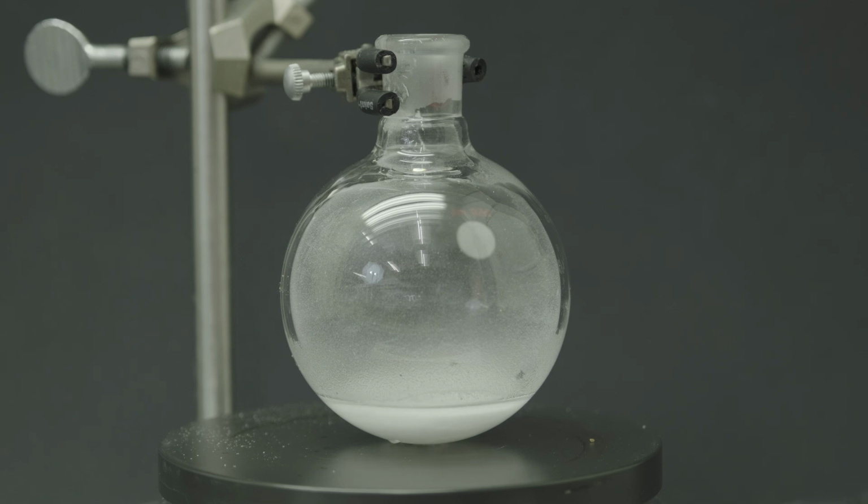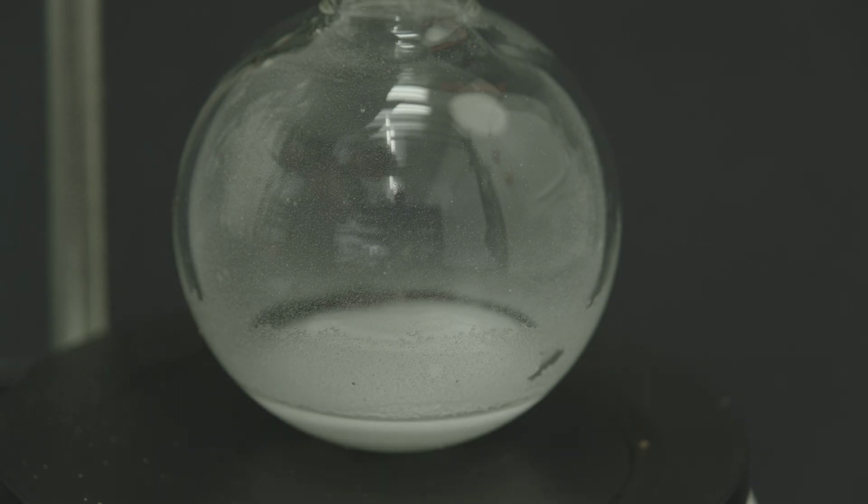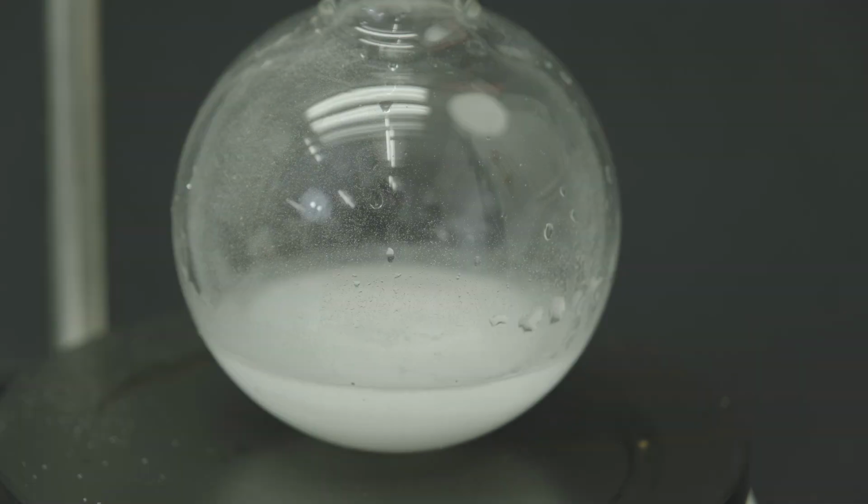For my catalyst, as I mentioned before, I was using phosphoric acid. I didn't need very much, I only needed a few drops. I then just let the reaction sit for a bit because I knew that there needed to be some time for the synthesis to actually occur.